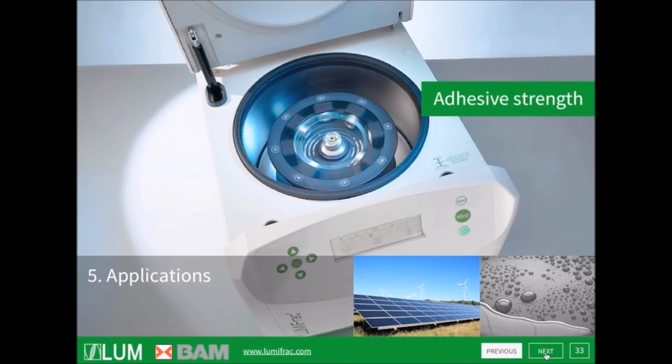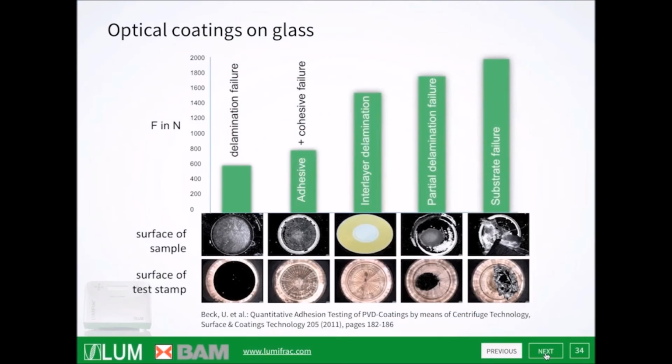Let us move now to applications dealing with adhesive strengths of coatings and films. The first example deals with optical coatings on glass. In this case, almost all failure patterns can be observed, such as delamination failure, adhesive and cohesive failure, interlayer delamination, partial delamination, or even substrate failure. To identify the failure pattern, a microscopic inspection is required, both on the test stamp side and on the sample surface side.